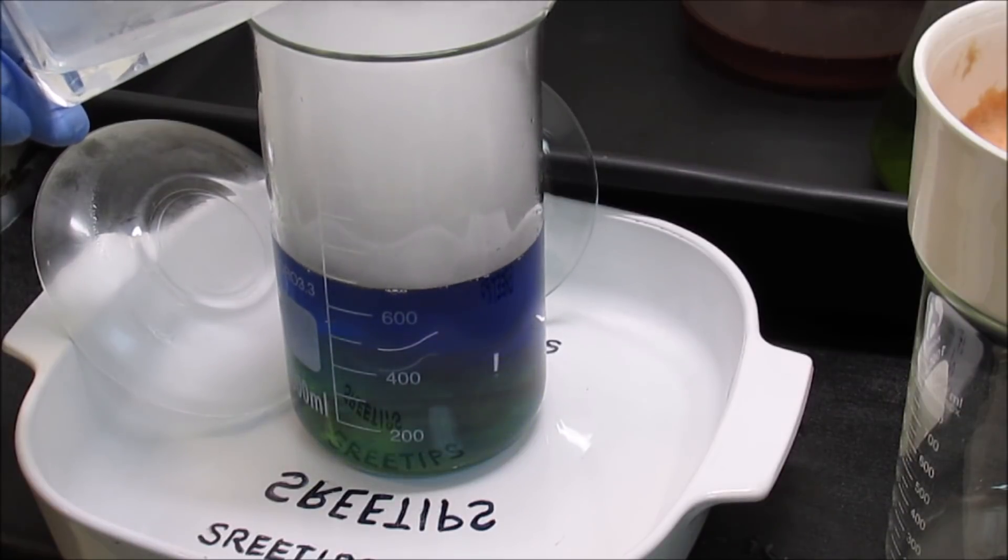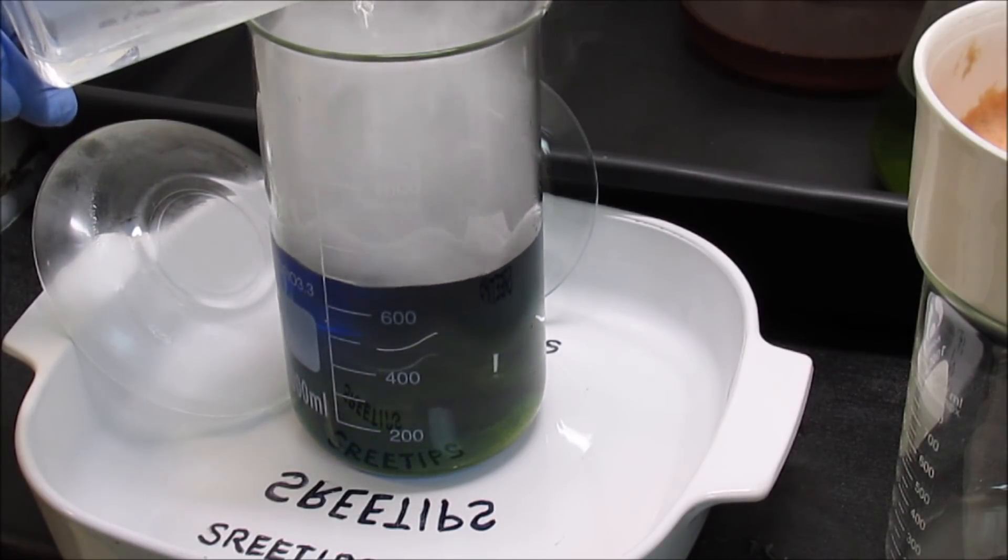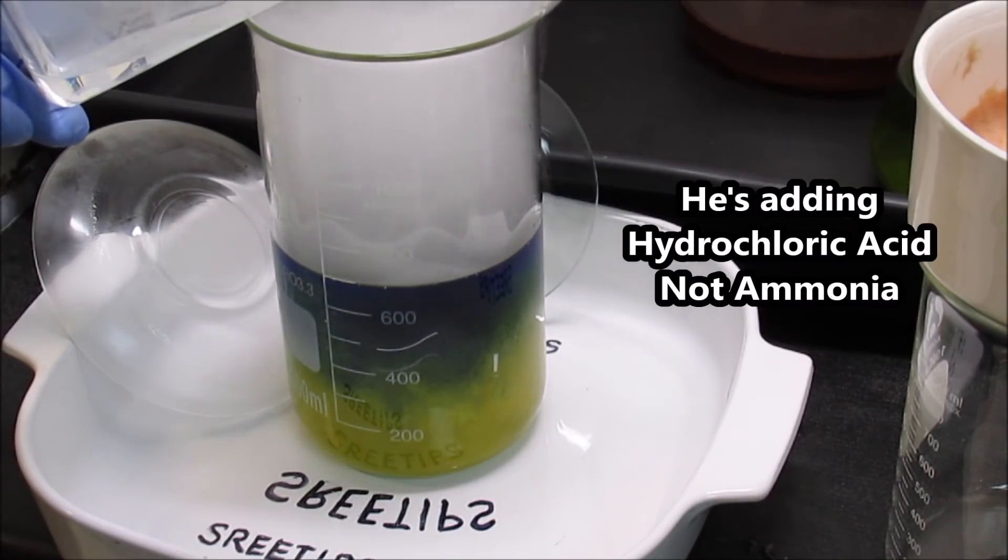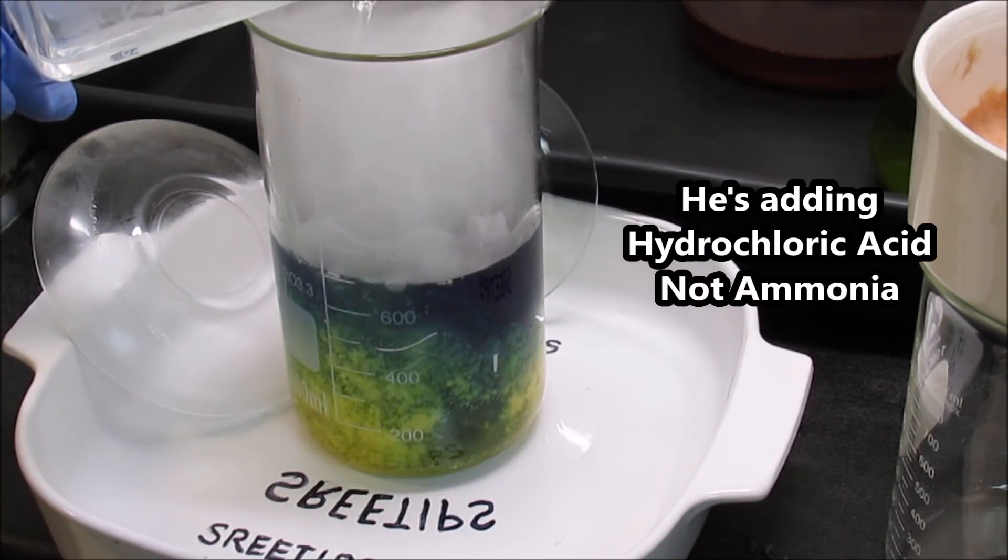Okay, I can see the yellow precipitate forming. There it goes. I'll keep adding ammonia and we should get some real bright, fluffy palladium salt. It's just beautiful.